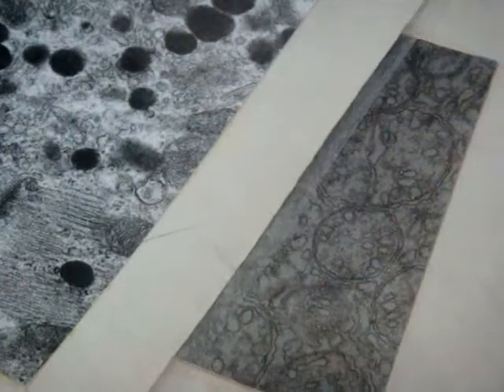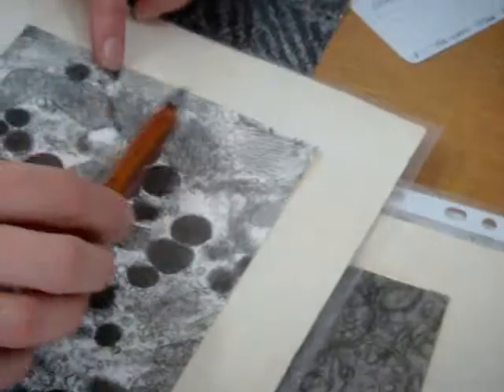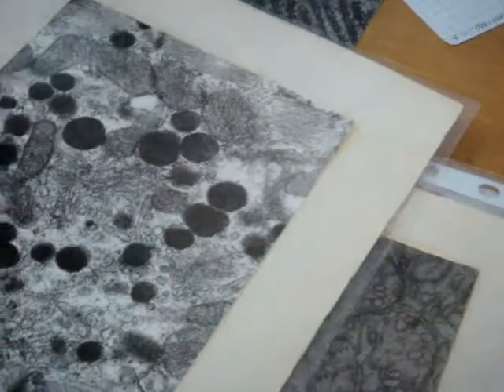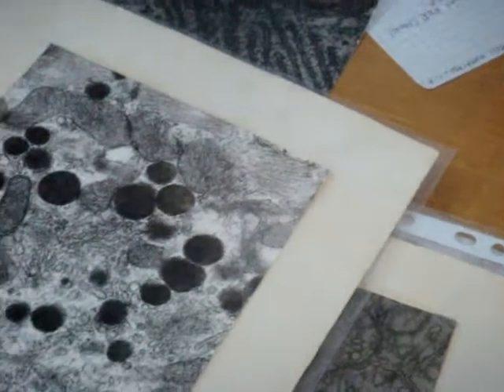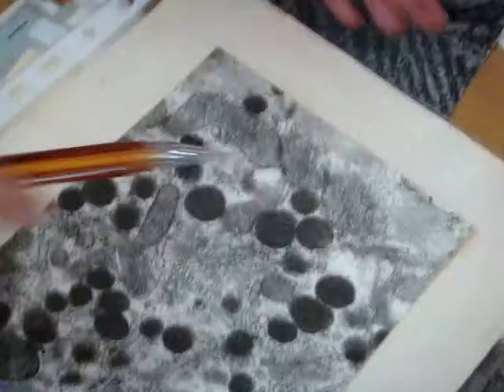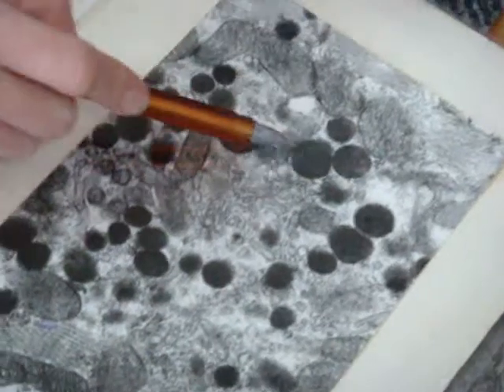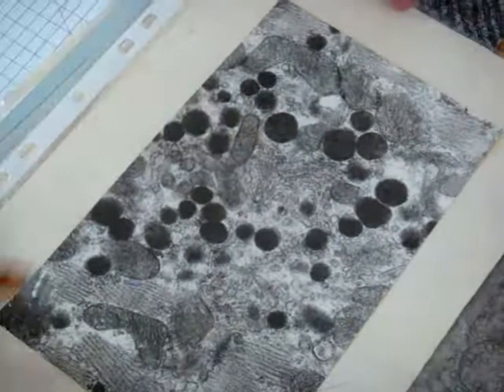Again, part of one cell, and we can see what? Striation, yes, myofibrils. And they are arranged, we can see sarcomeres. It's an oblique section. Now, what is this, the very thick and thin filaments, this line? Because they maybe go in different directions, and we can see secretory granules, this is cardiac. This is the Golgi apparatus. This is mitochondria. Okay.